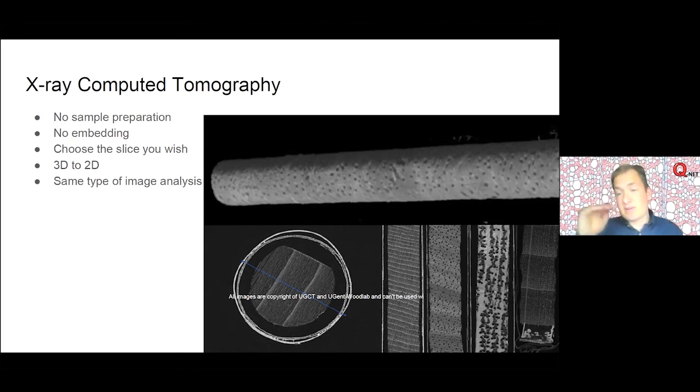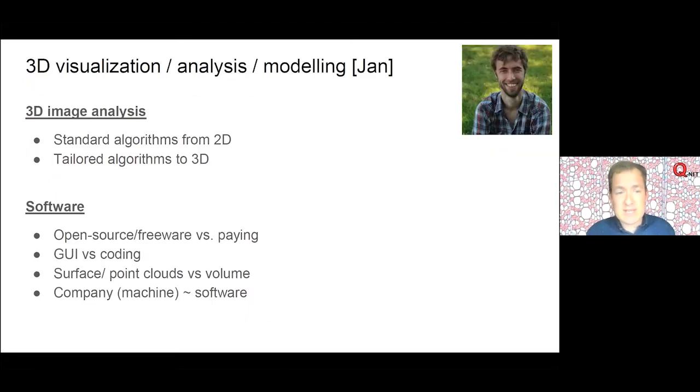Once you have extracted the proper slice or a few slices, here you see one for bristlecone in the first pane, then birch, then oak, and then beech. Then you can just export them to standard image analysis software as you would treat CLSM images or anything else. But I think it's now up to Jan. I think you can also stay in the 3D image itself, right, Jan? So I'll let you talk about the actual 3D analysis on 3D images.